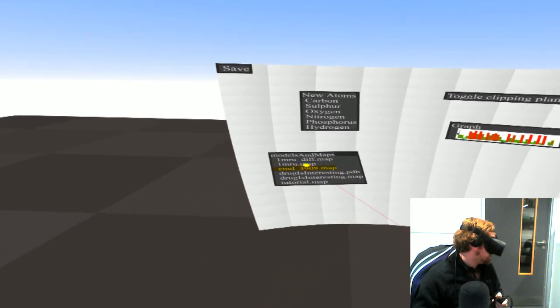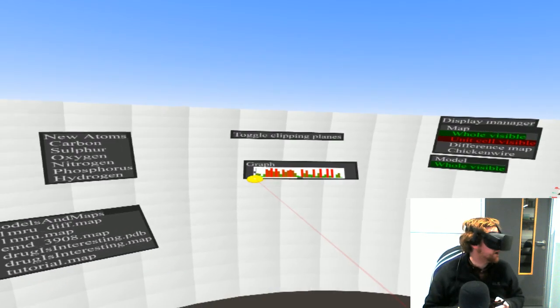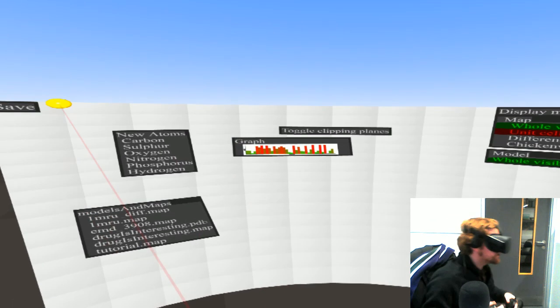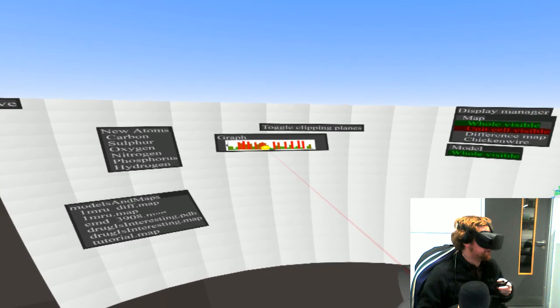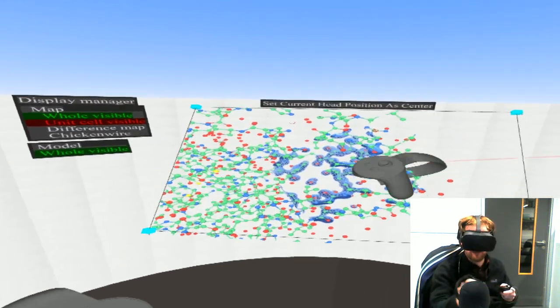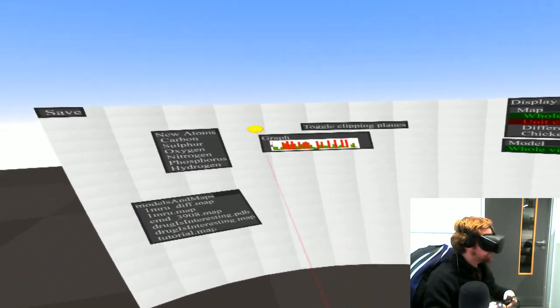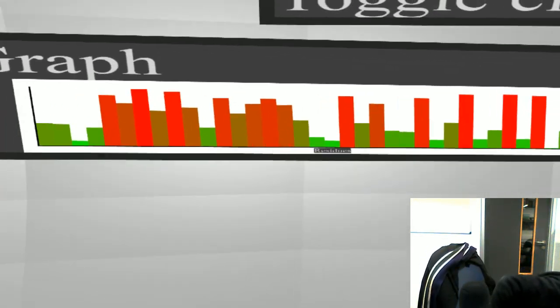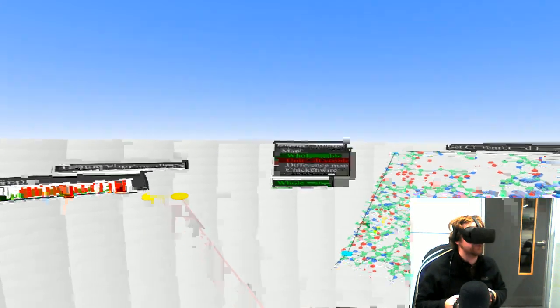Here I've got sort of a file directory, so I can load different data. You want to be able to visualize various metrics that you've got. I definitely need to work on this. It is implemented for you to be able to click on a residue here and it zooms to that particular residue being centered. But it's not working right now, and the markup is such that I have to look super closely to even read the axes.